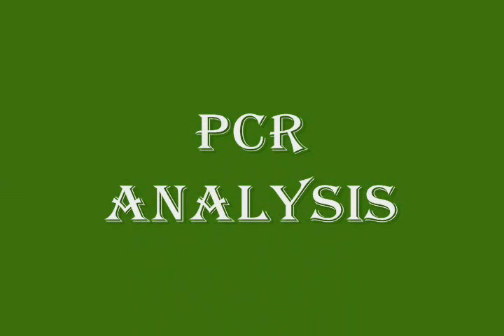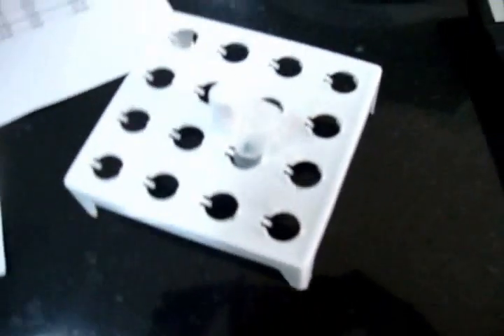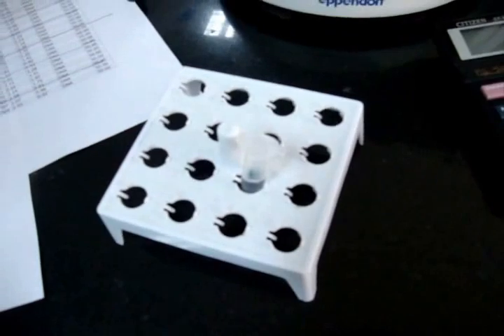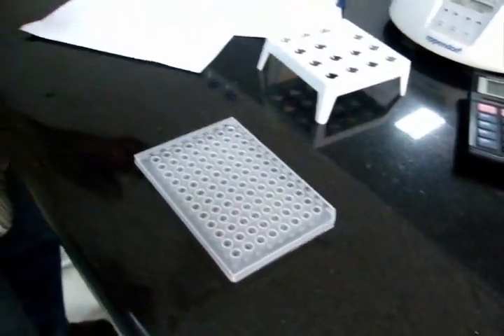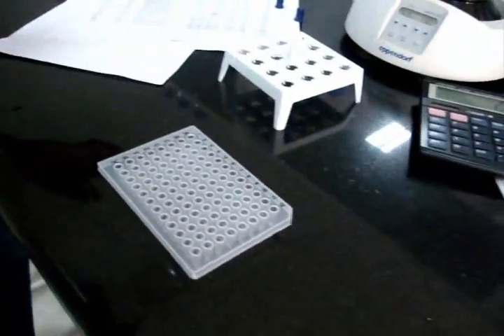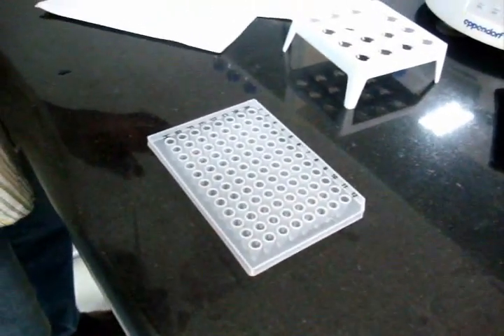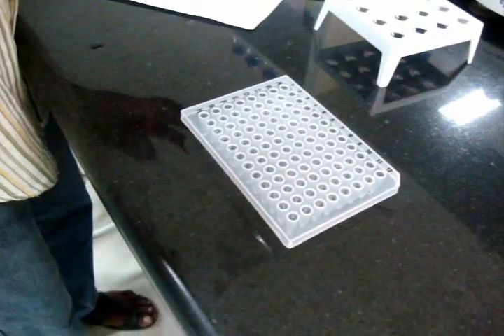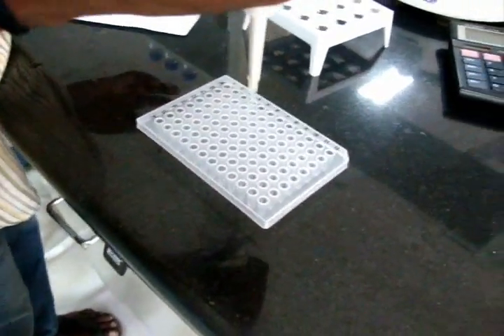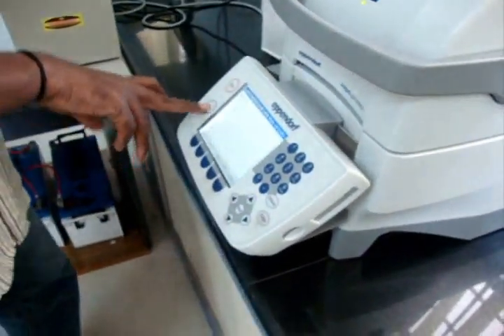The next step is PCR analysis. First, the genomic DNA is added into the PCR plate, then add the PCR mixture into the PCR plate. Place the PCR plate in the PCR machine.